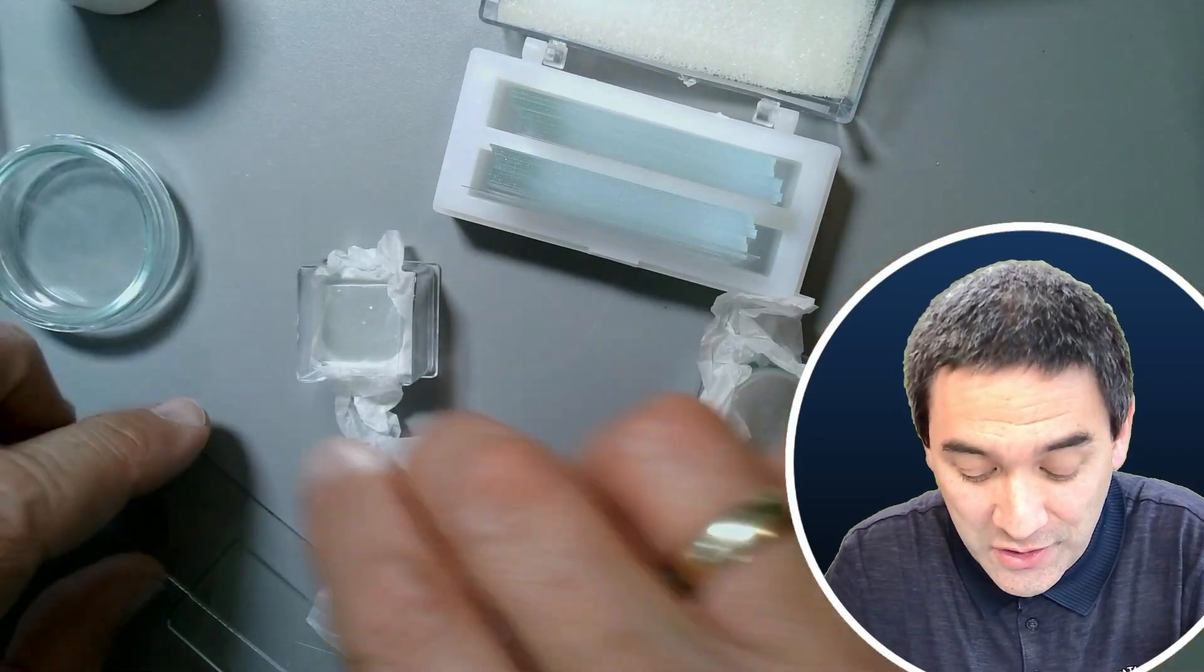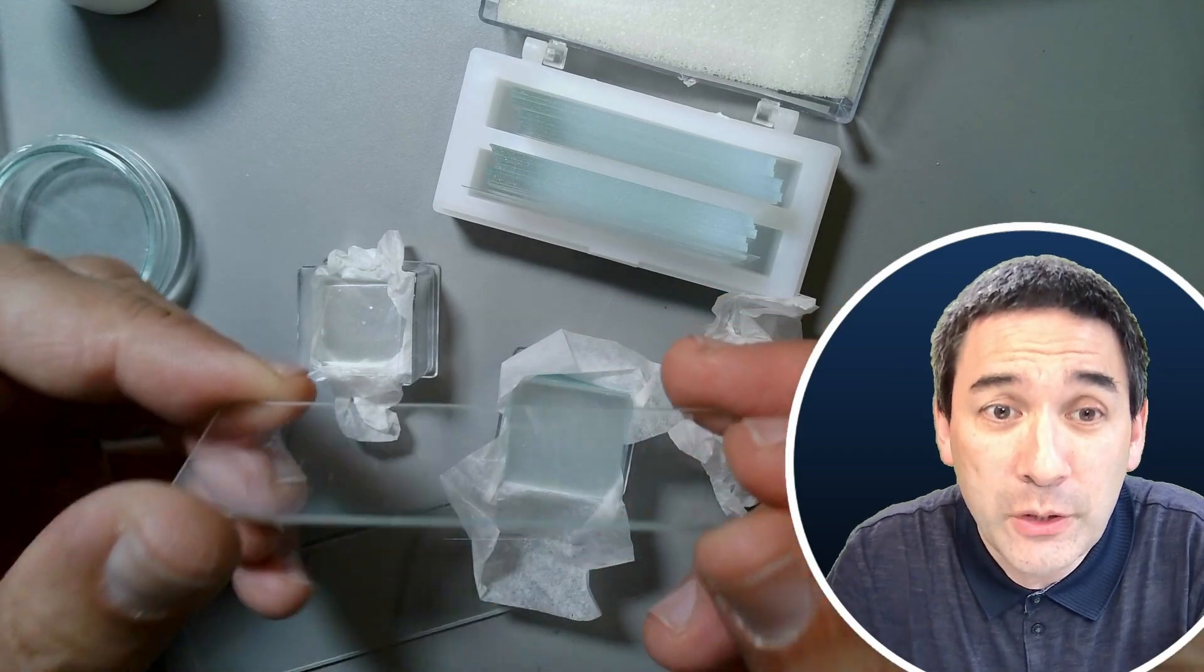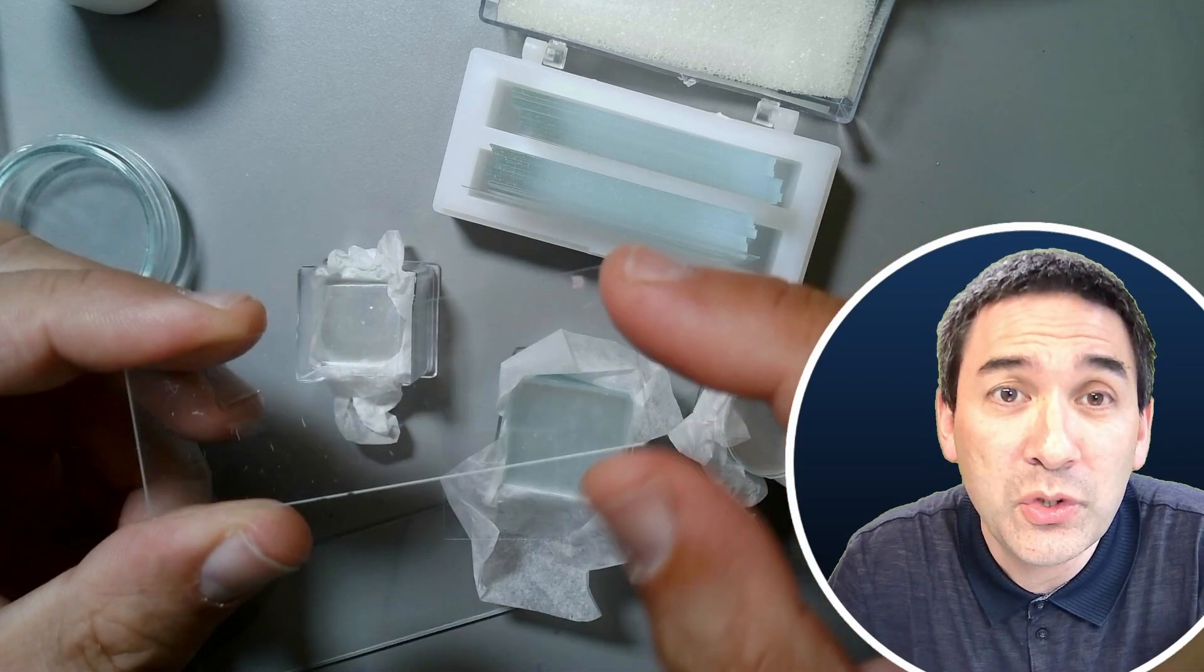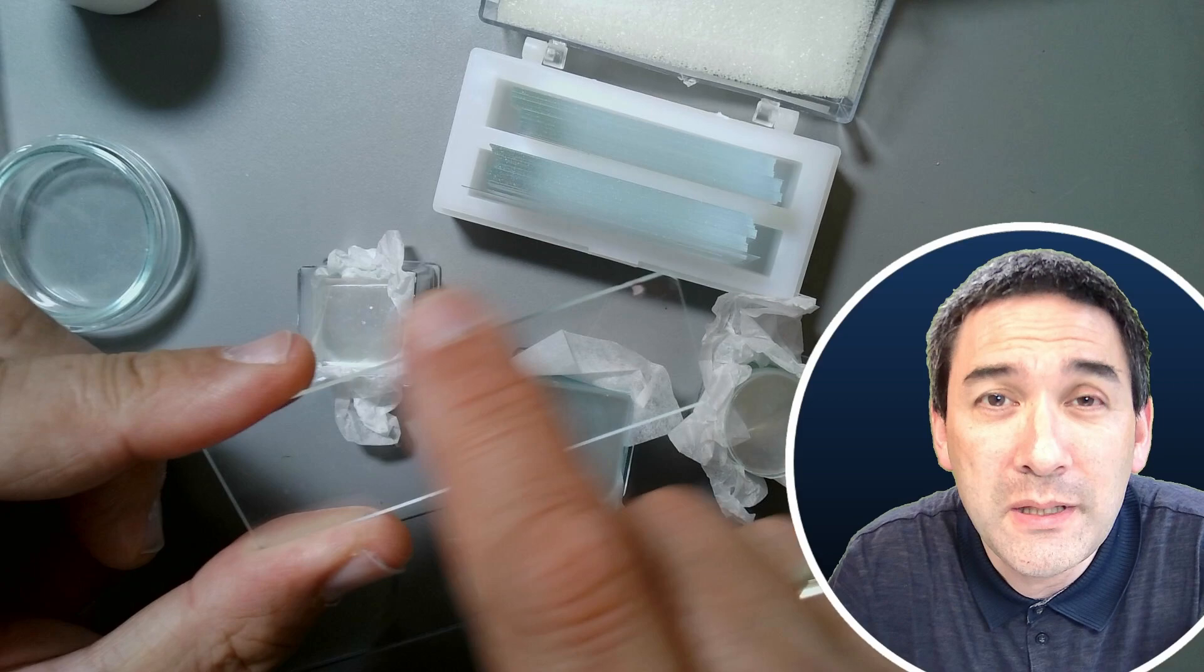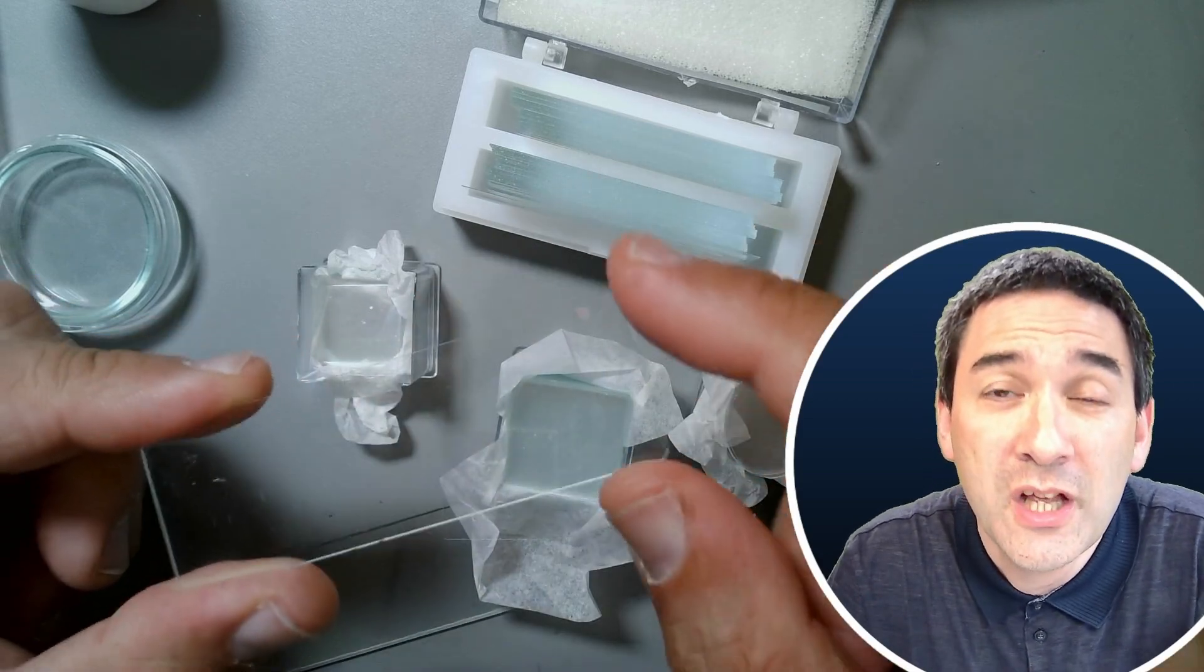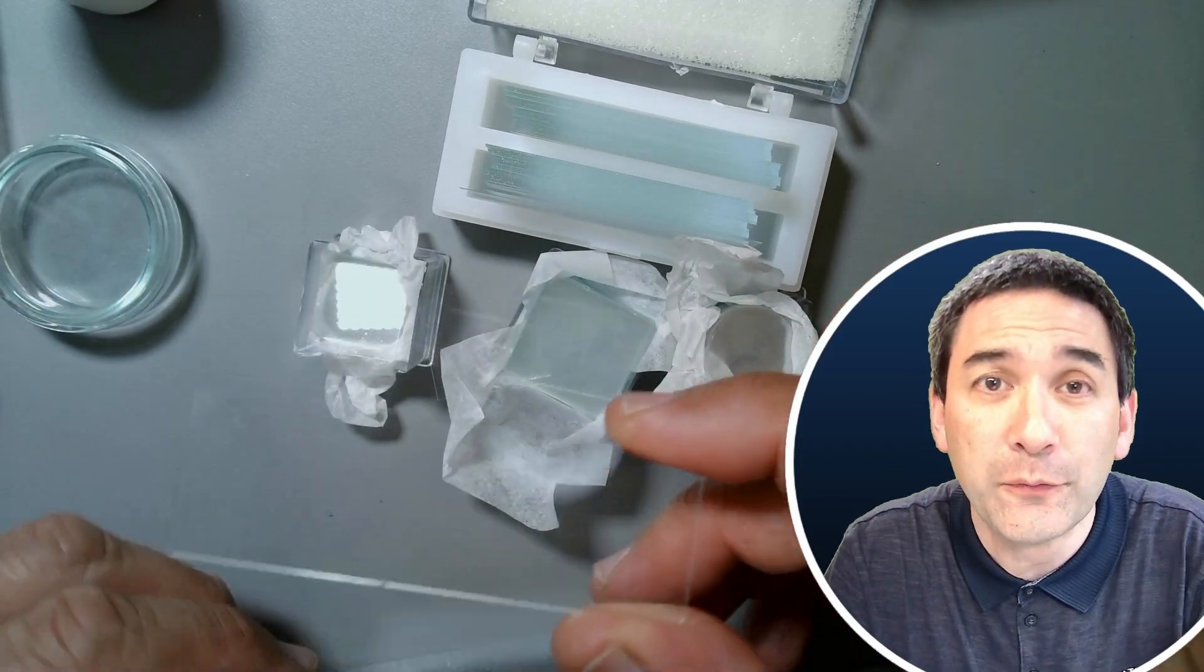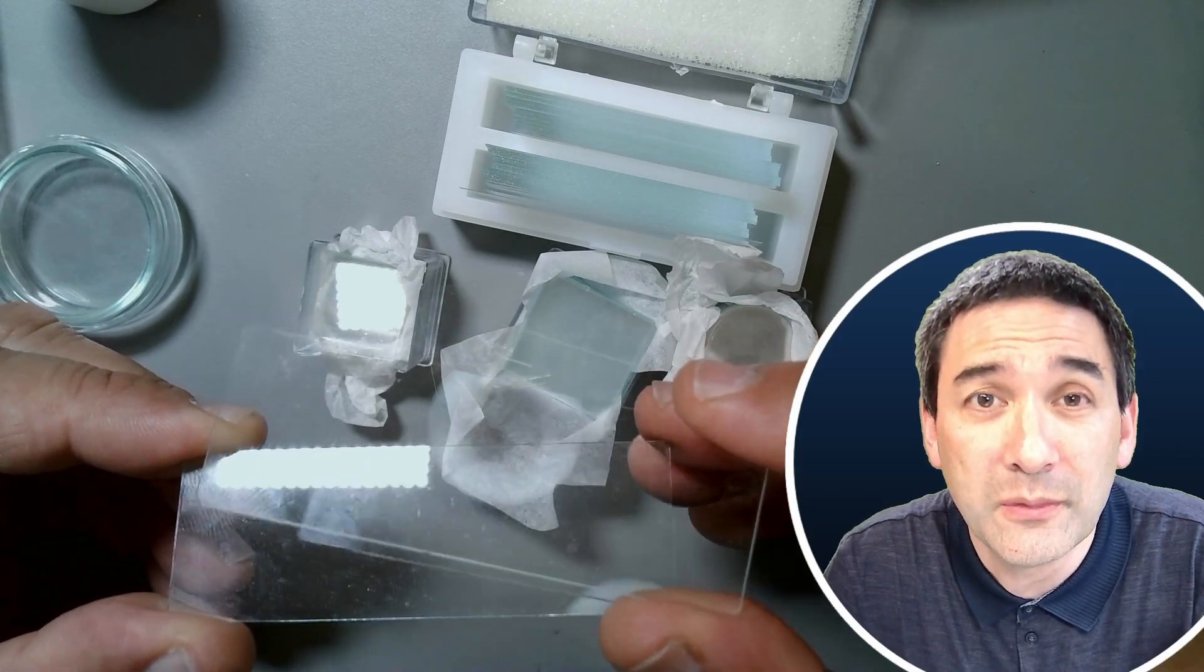Microscope slides are made of glass, obviously. Approximately one millimeter thick, 2.5 centimeters wide and 75 millimeters long. That's 25 by 75 millimeters, one inch by three inches approximately. Those microscope slides come in different qualities and also different modifications.